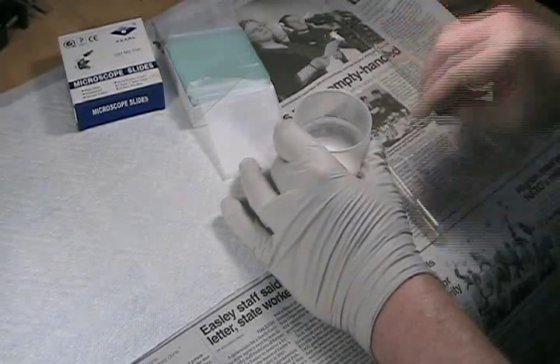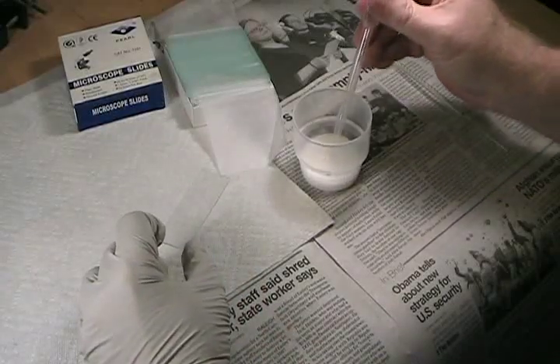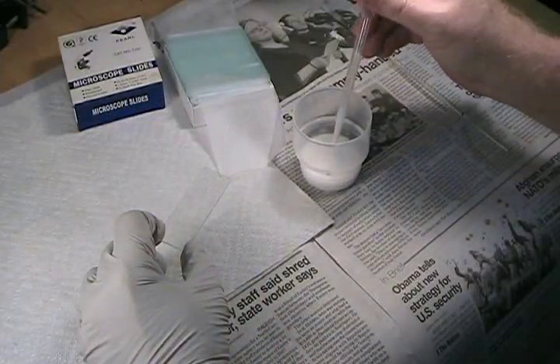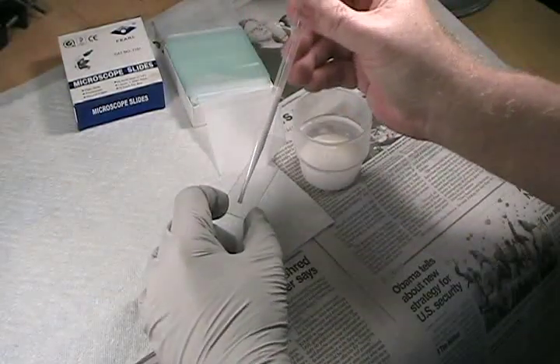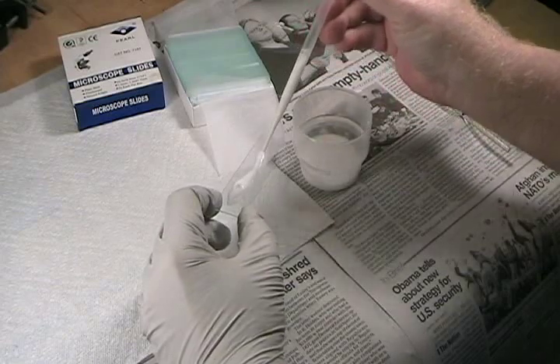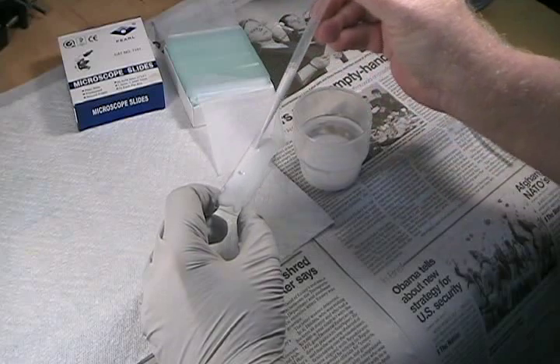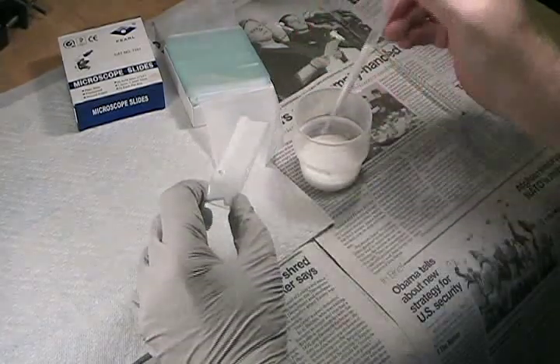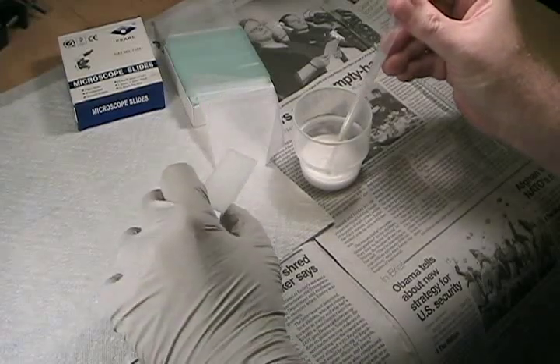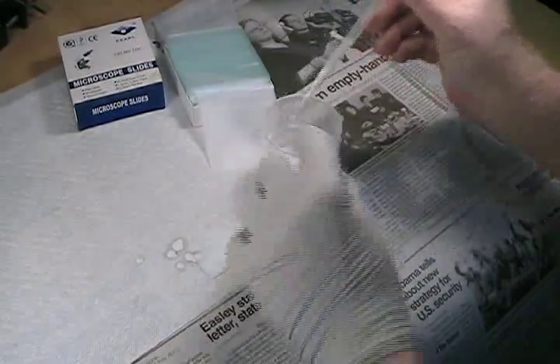You have to work quickly because you want to get this used within about two minutes. Take a microscope slide and draw up about a milliliter and a half, perhaps two milliliters, and simply squirt it onto the slide. I'm wearing gloves here, but that's not because the slurry is at all hazardous — it's to avoid getting fingerprints on the slide. Distribute it out over the slide evenly and simply lay the slide on a paper towel.